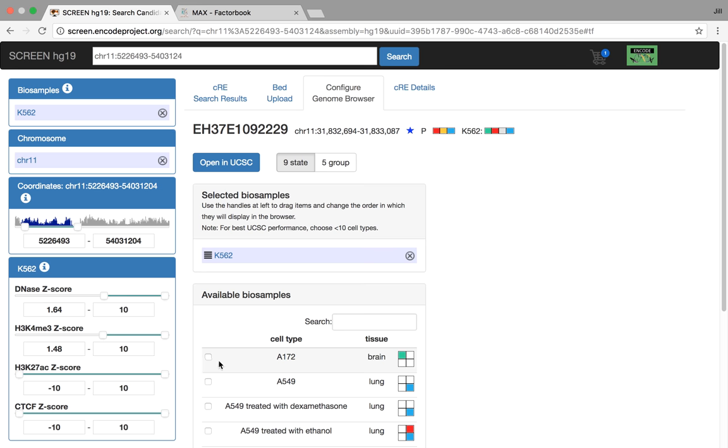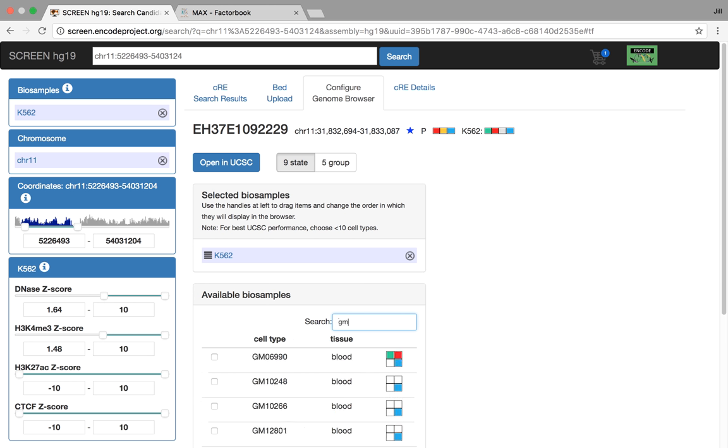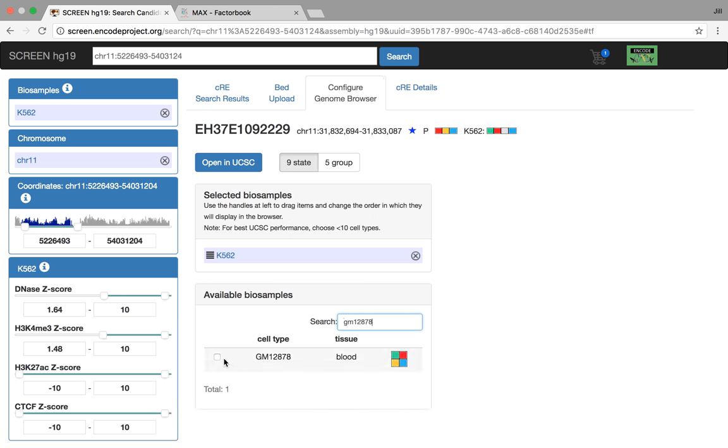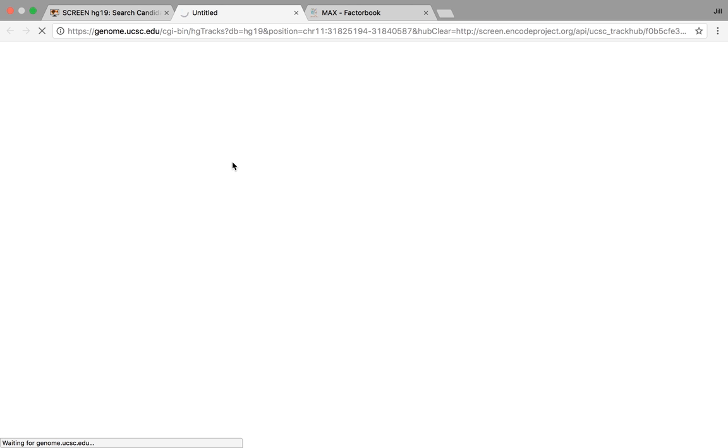So for here, for instance, you can actually search across the 700 or 600, 400 or so cell types available and add in whatever you'd like here. This configures a dynamically made UCSC genome browser track hub that you can then open up and actually view and add in your own tracks and do whatever you'd like.